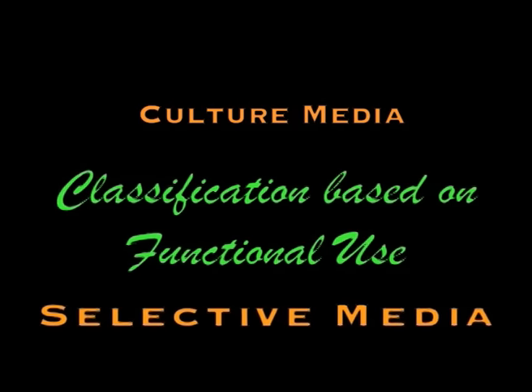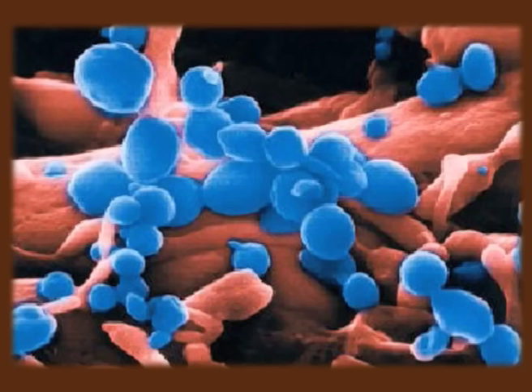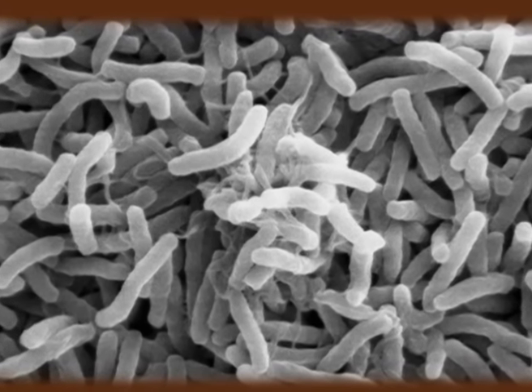The third kind of media which falls under the classification based on functional use is selective media. As the name suggests, this kind of media can be used to grow only a specific group of microbes. Why? Because these media contain antibiotics or bile salts or certain dyes which prevent the growth of a specific group of bacteria while permitting the growth of a particular group.